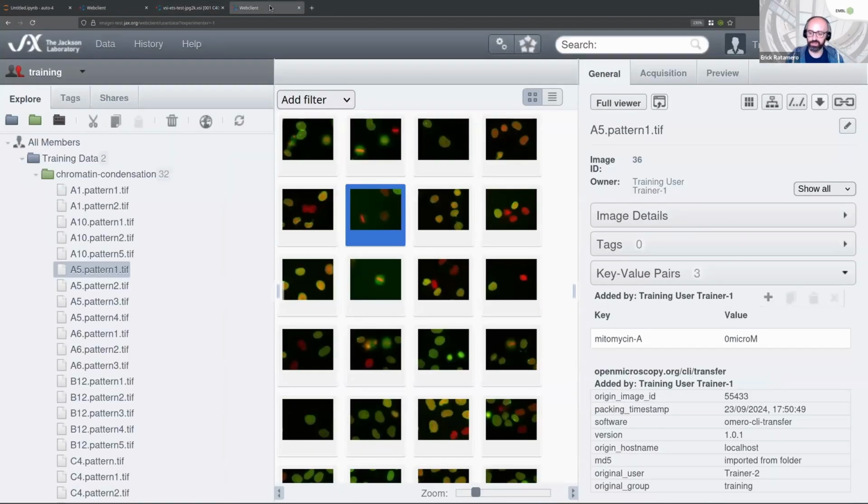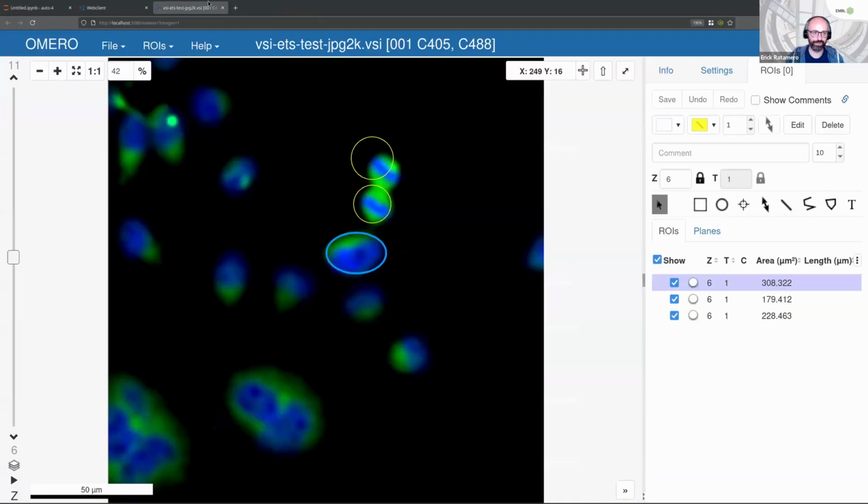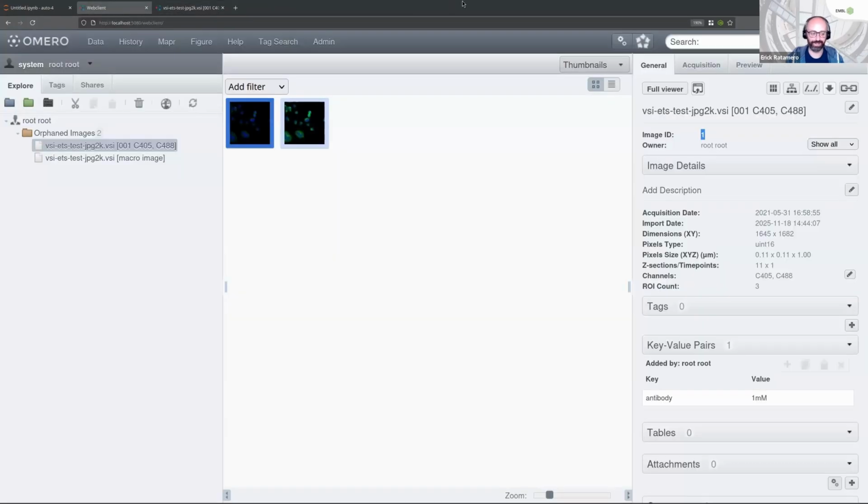Okay, that was probably the quickest introduction to OMERO I've ever done in my life. Are there any questions? Anything I forgot to add, Kiya? I am not seeing any questions, but I'll give people a minute.